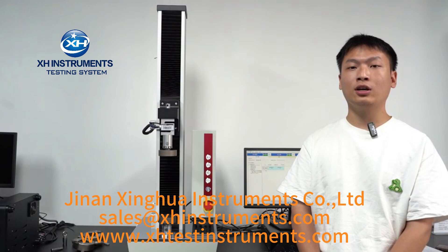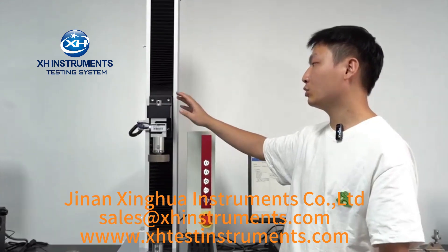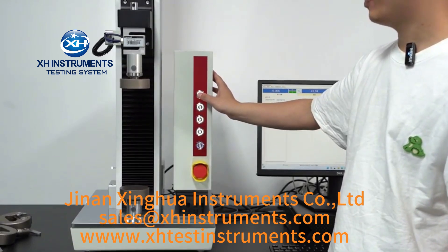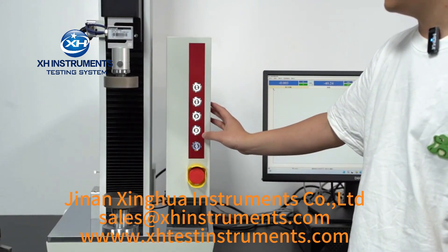It is equipped with a fully closed-loop program control and supports limited force loading, force holding, and fatigue testing functions. The main body of the equipment is a rigid frame equipped with movable crossbeams, which are controlled by servo motors to move up and down and apply loads. During the experiment, you can move the crossbeam for loading and unloading according to different testing requirements.